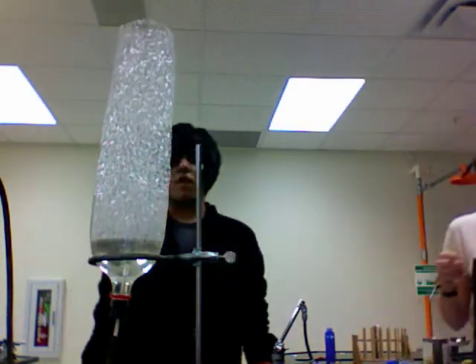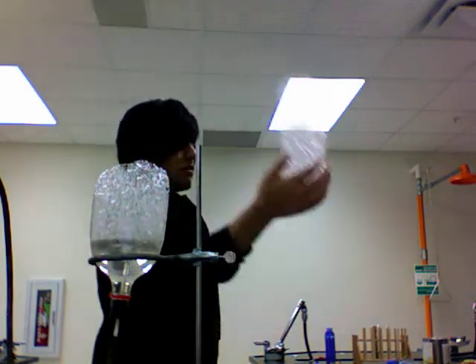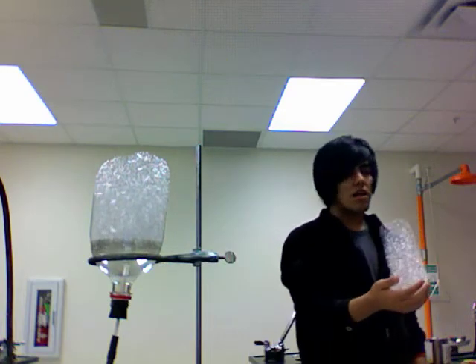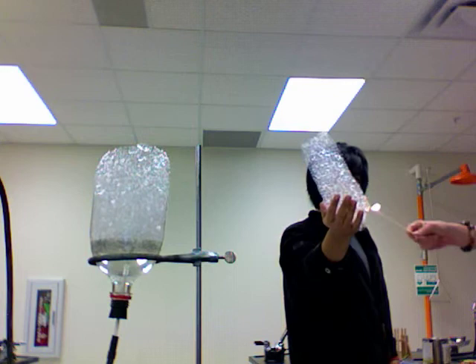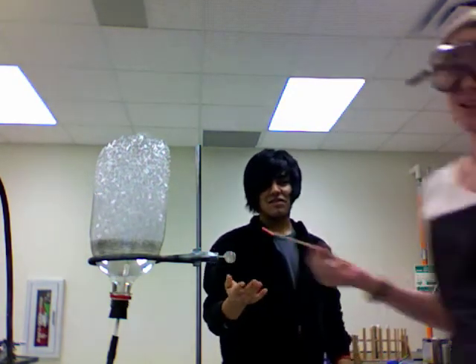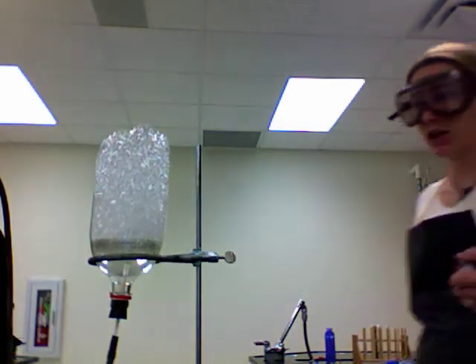I'm gonna have Jose come in here and scoop this tower of bubbles off. So that's the methane mamba — methane burns very, very well. Probably shouldn't hold the glowing splint that close to methane.